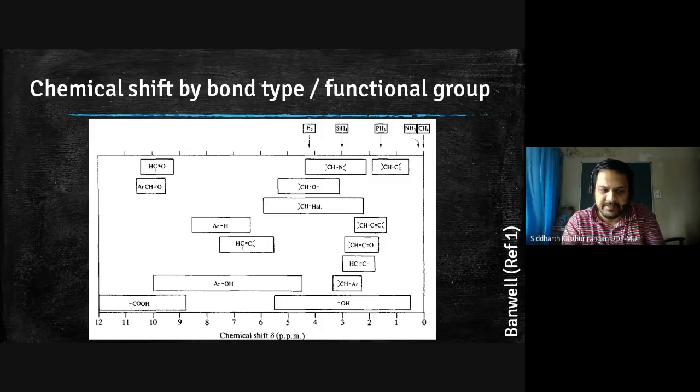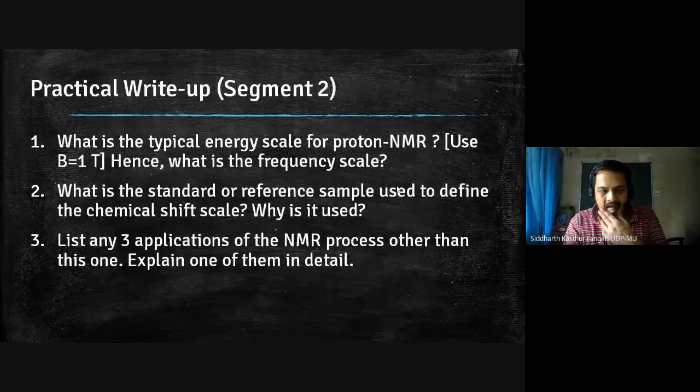If you don't have the mass spectrum, you can only say it is this type of compound, an alcohol or a phenol type or an alkane or an alkene or a ketone, whatever. But you cannot pinpoint the structure. To pinpoint the structure, it is important to have the mass spectrum also. That was my point. Is it okay?